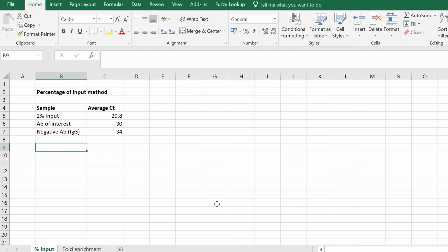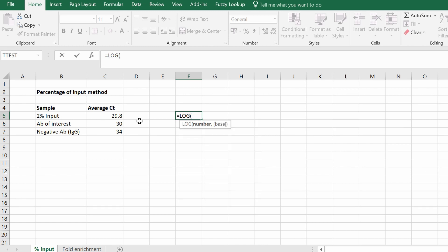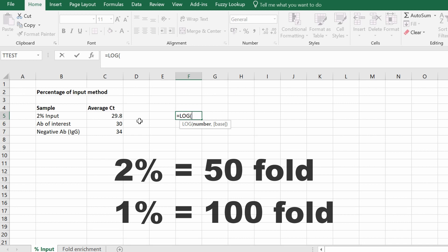What I have here are just average CT values for these three samples of the technical replicates. The very first thing you need to do is adjust the CT value of our input sample to reflect a 100% input, because in this example it is a 2% input sample. To do so, we need to use log base 2. If you have a 2% input sample this represents a 50-fold dilution; if you had a 1% input sample this would be a 100-fold dilution.